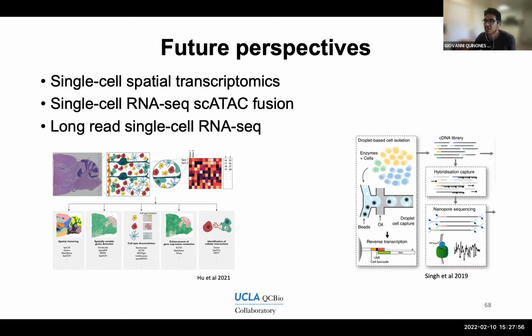But spatial transcriptomics is this type of sequencing where I used this diagram before to show how you can find many different types of cells within a very small area of tissue. And this plot was actually from a review paper in spatial transcriptomics.